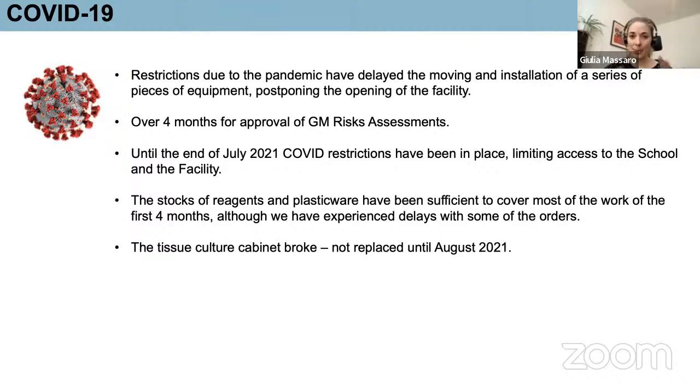While the person was sitting in the hood splitting the cells, I was standing in the corridor shouting how to split the cells, what to do, what not to do. Then they would come out, I would go in, check if everything was fine, and then we would swap places around. So it was quite a convoluted, complicated process.